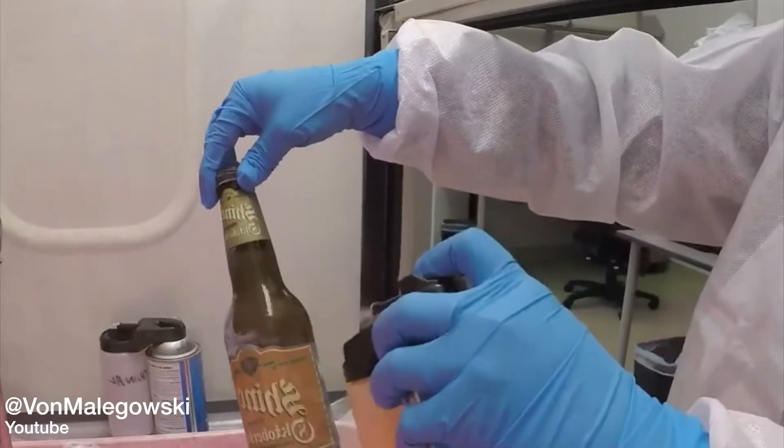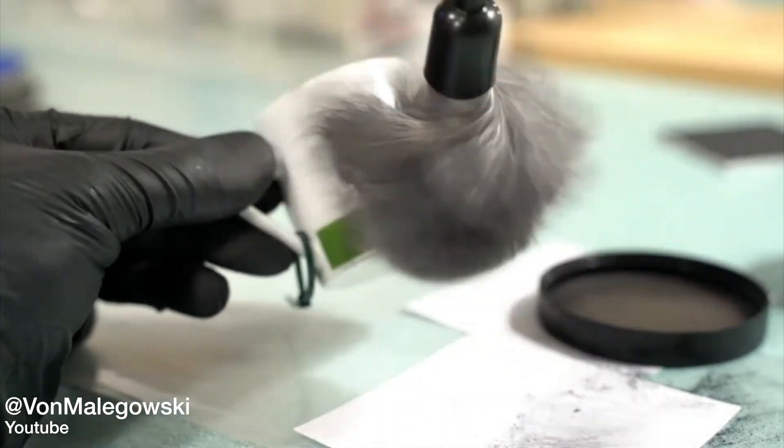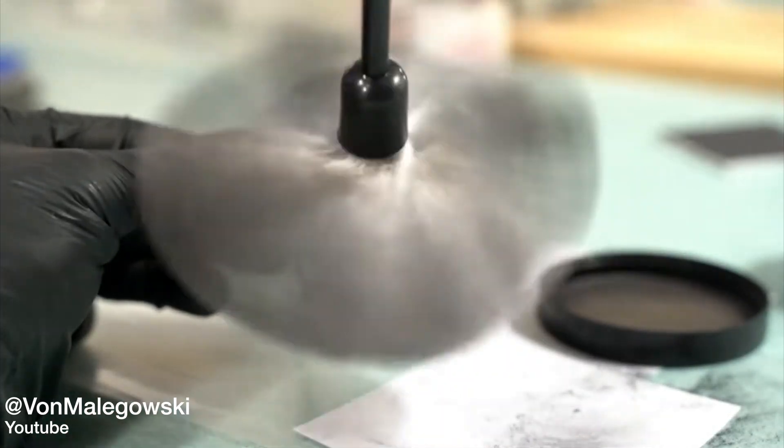So what do we do after we've developed it? Well, if we need to enhance the contrast, we can dye-stain it with some fluorescent dyes or we can apply normal black powder to it. Because it is polymerized, it's hard, so we can do multiple different processes to give us the best contrast and the best visualization of that fingerprint.